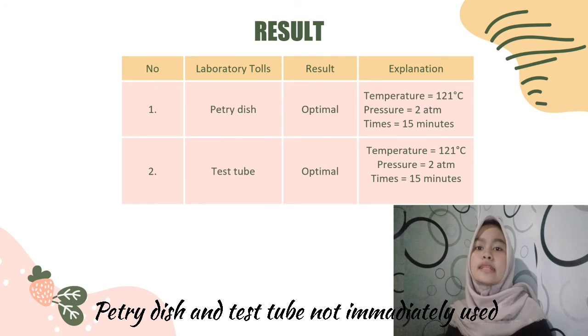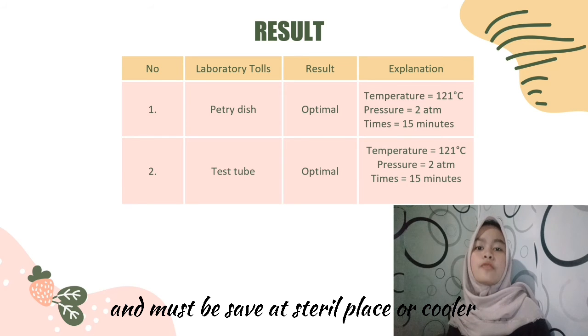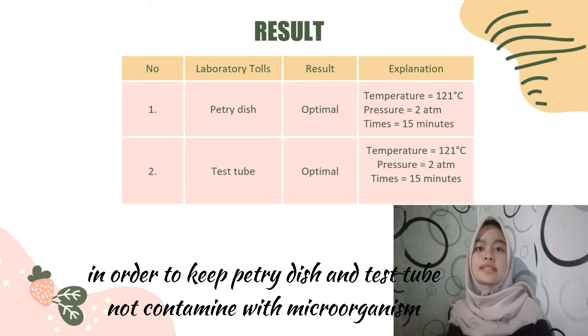Petri dish and test tube that are not immediately used must be saved in a sterile place or cooler in order to keep petri dish and test tube not contaminated with microorganisms.